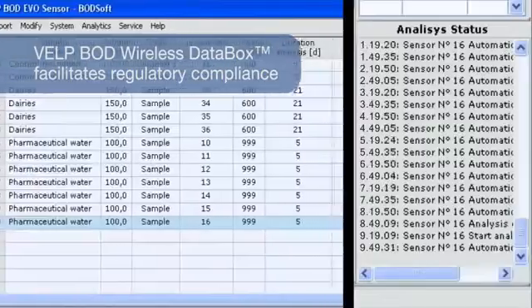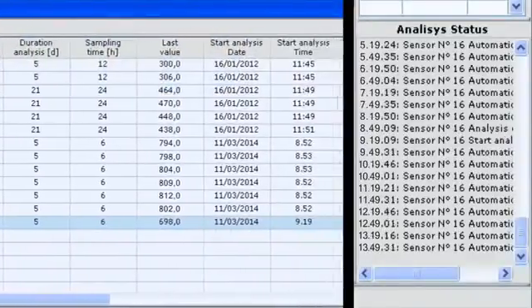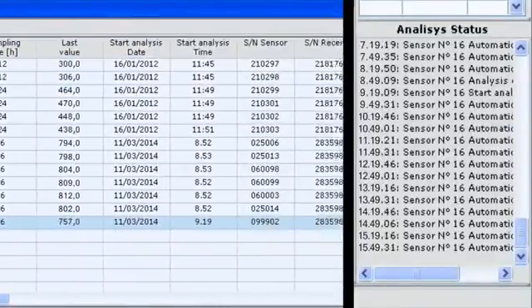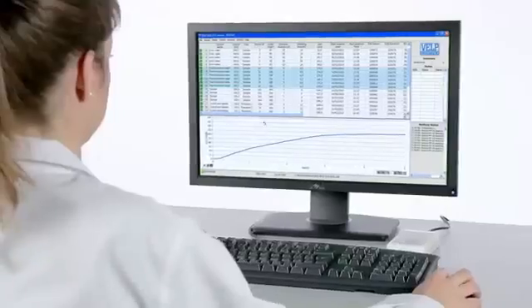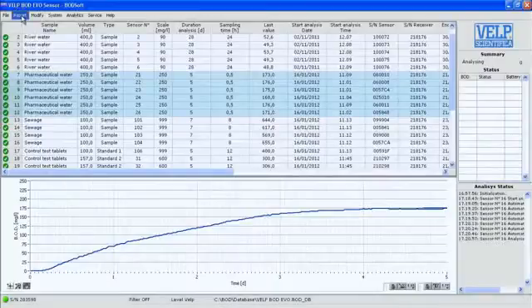The exclusive wireless data box facilitates regulatory compliance, continuously monitoring and reporting parameters shown through BODSoft when connected to a PC. Once the analysis is completed, all the results are stored in the database.